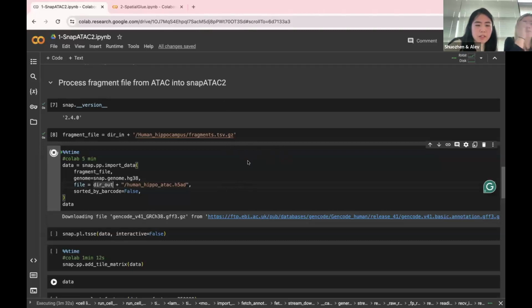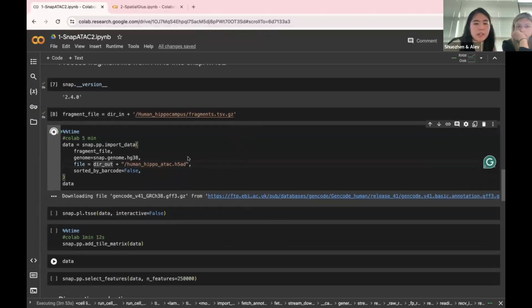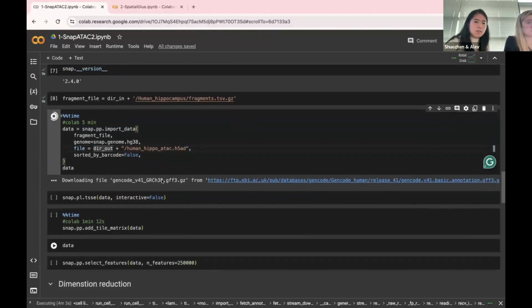Google Drive mount actually can be used not only in Google Colab, even in the Jupyter Notebook. As long as you have the package of the drive, you should be able to use that. Yeah, I have never tried it, but you can see. For people who have the HPC, like high performance clusters, actually you can use the Jupyter Notebook to run it. It takes longer than usual.